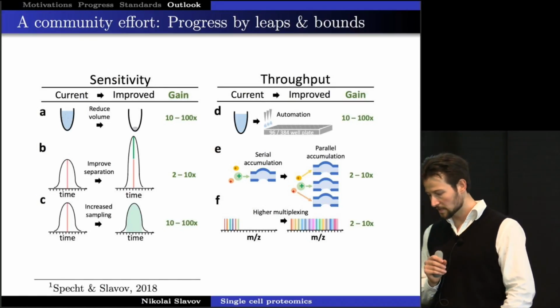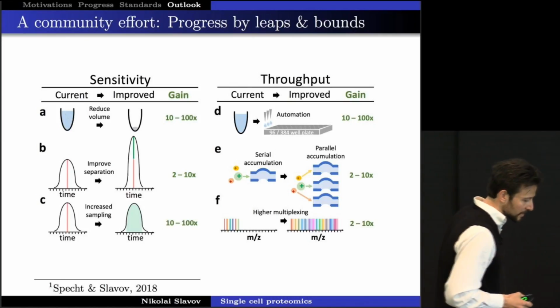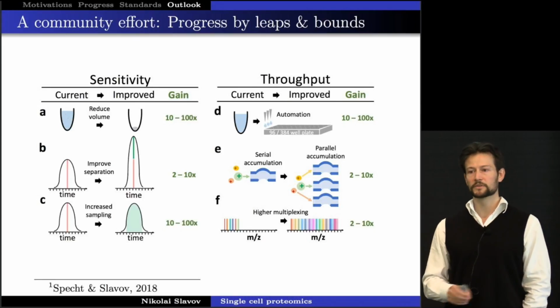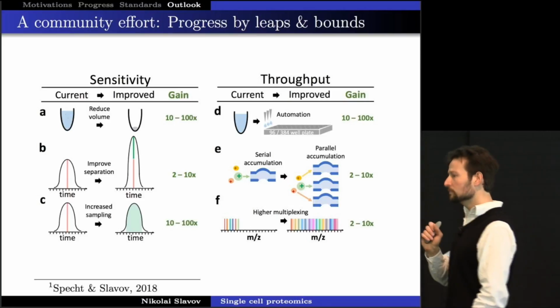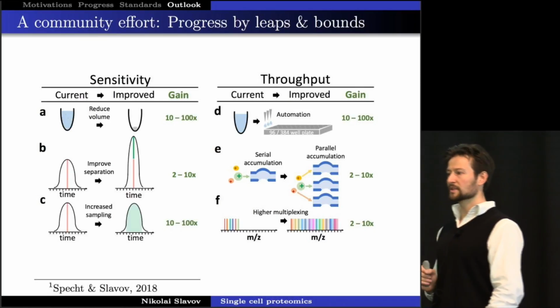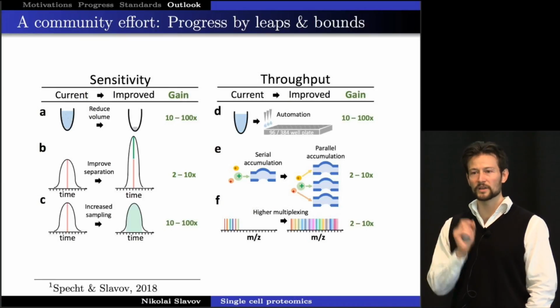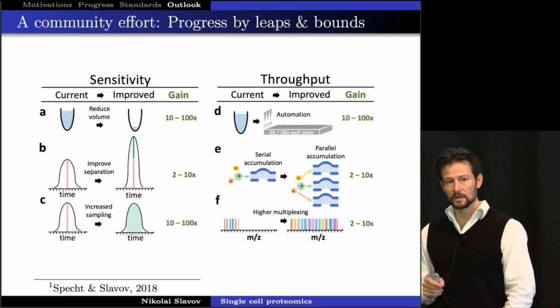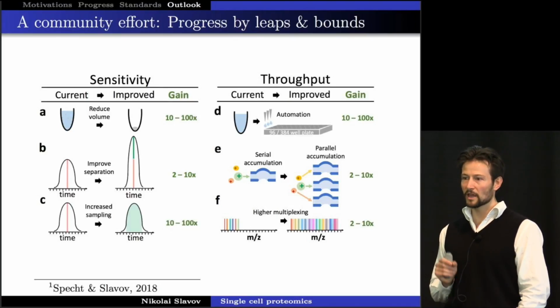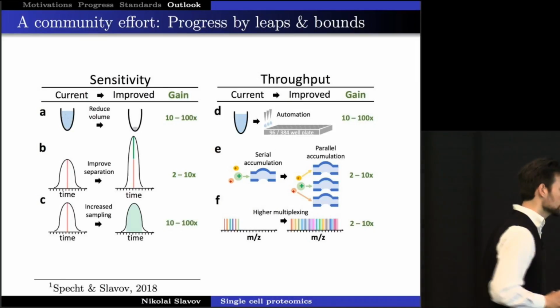in terms of diagnosis, but also in basic research, in terms of figuring out ribosome specialization, synapses, and their proteomes in translation, and in terms of being able to do very accurate modeling, leveraging these data. Because as powerful and wonderful as RNA sequencing is, it has this terrible sampling problem that you cannot avoid unless you get every single molecule, simply because RNA is less abundant. With proteomics, I strongly believe that we can get far more quantitative, accurate data because we don't have the sampling problem, the Poisson distribution.